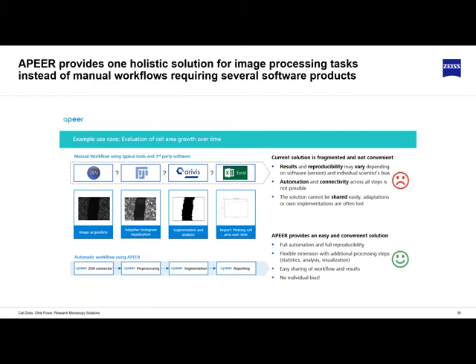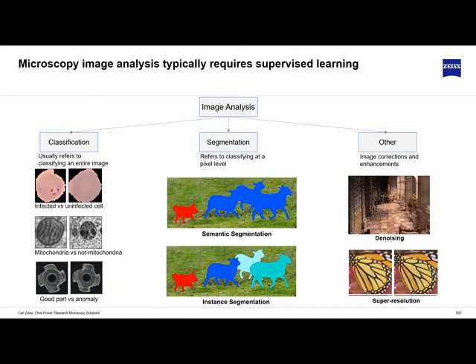And this also lets us use some of the state-of-the-art processing. So I'm not going to go into full processing now because the talk's already long enough, but if I just highlight the picture in the middle here, this is an example with a sheep and a sheepdog. Now, to differentiate the sheepdog, which might be a black sheepdog and it might be white sheep, you can do that with semantic segmentation reasonably easily.